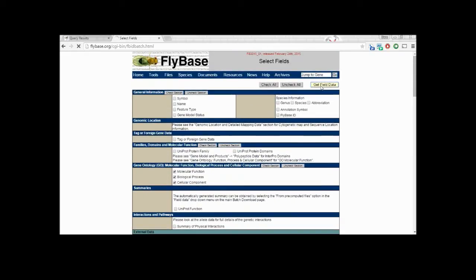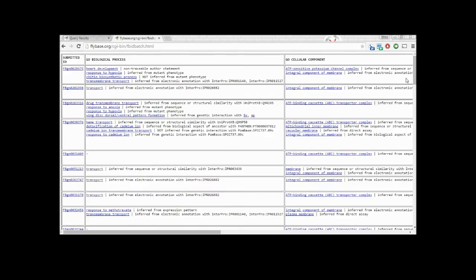This outputs a table with all the data we asked for compared side by side between all of our genes of interest.